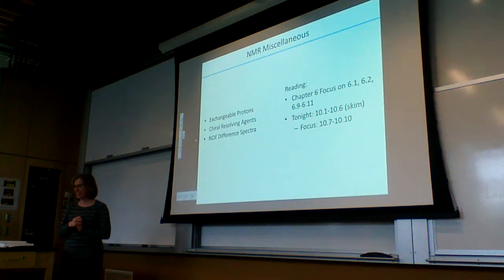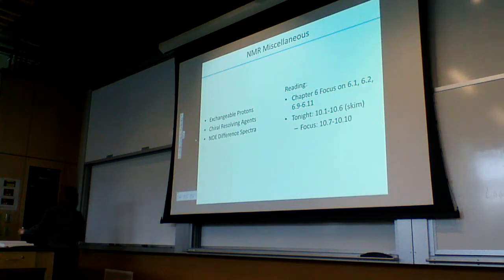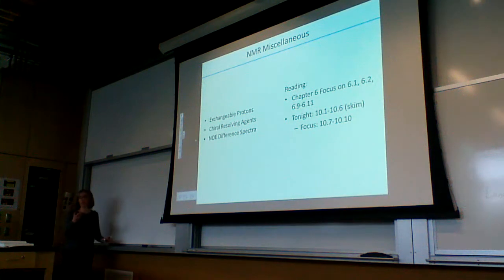Yes. So I understand finding between the peaks what they are and then making the little tree diagram. I'm not certain, I guess, for instance, like on the lab, on the post-lab that I was doing, it was like, split this one once at this number and split this one three times at this number. How do you know you have to split it three times at the same number versus one time? Well, that would mostly be dependent on the structure that you're looking at. And the examples I did in class, all of our hydrogens were different, so they all had different coupling constants because they were either diastereotopic or on the alkene, so they weren't the same.